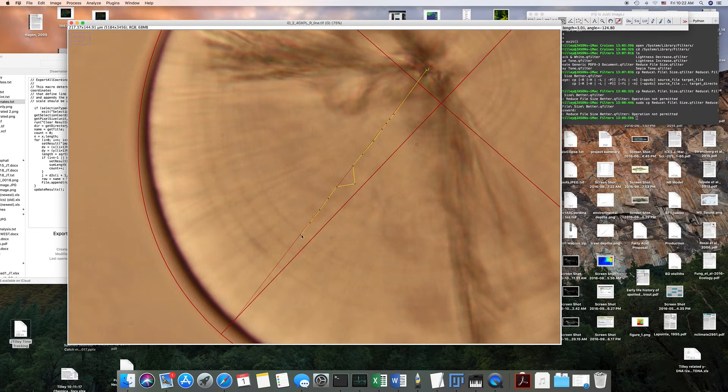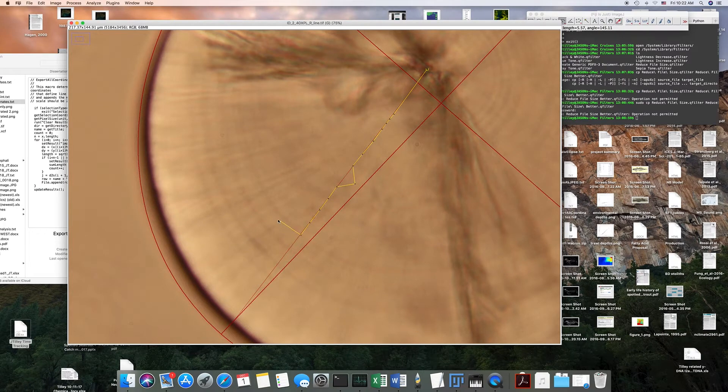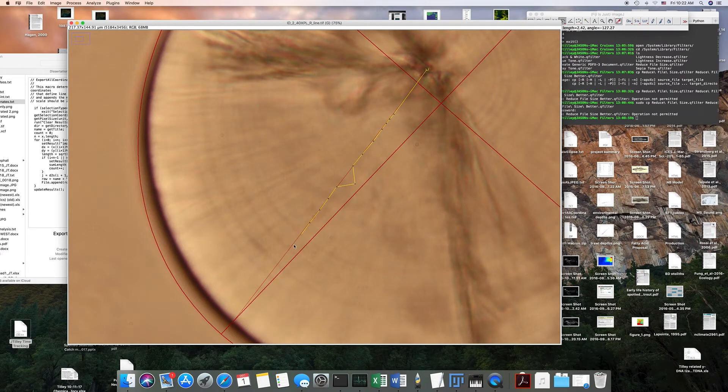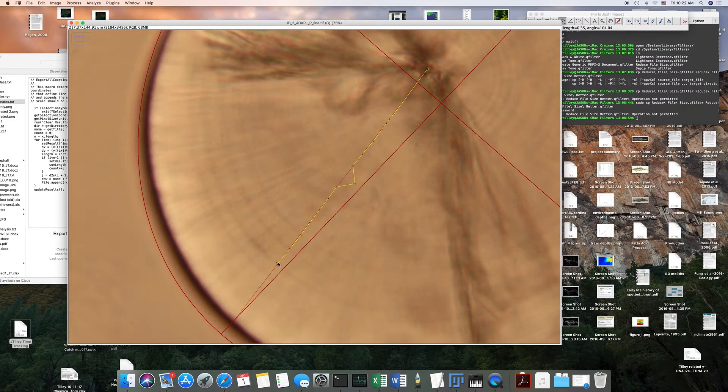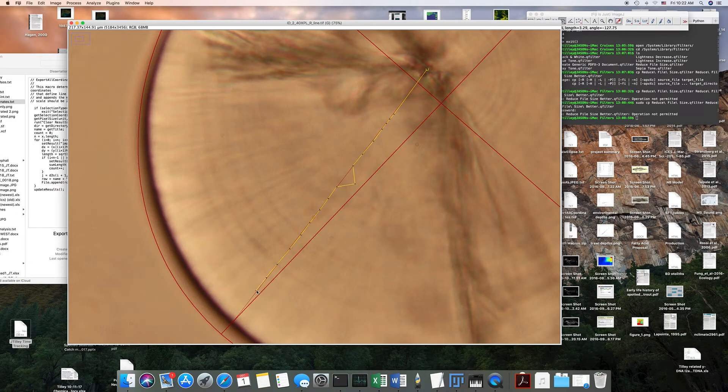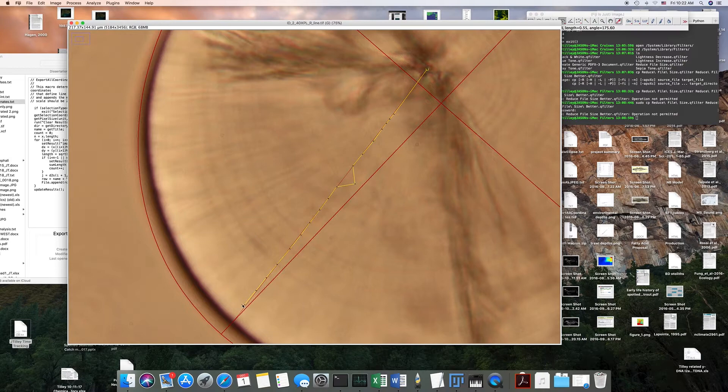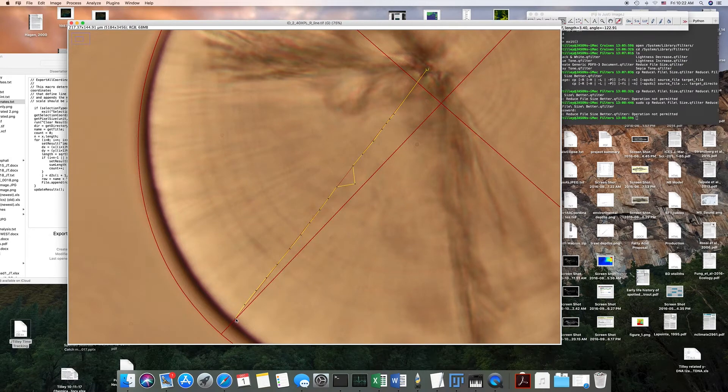...there's no increments in between these. And let's say there's one here and there's one here, and then I don't really see another increment, it's probably there.